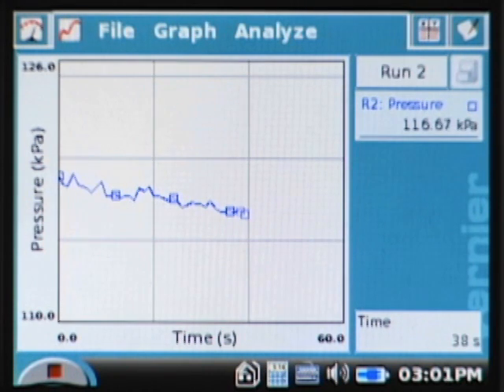Now you'll notice right now that it's only displaying one of the runs. That's the second run, and it's also in a different color—it always defaults to going to a different color when you do another run. I'm almost done there.